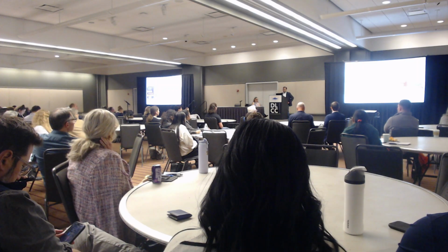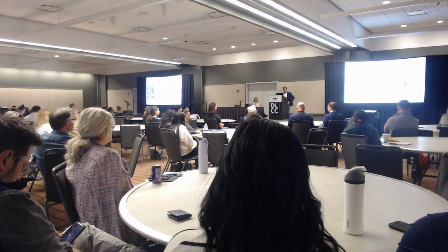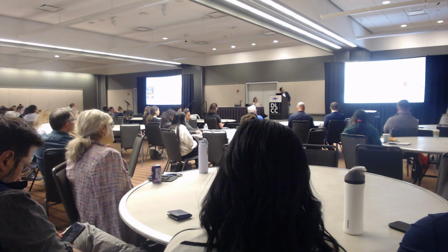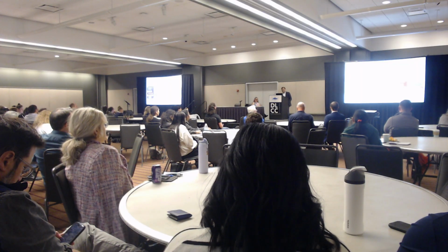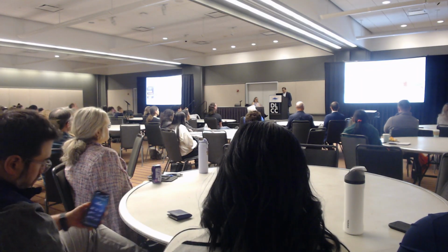So a lot of clinical colleagues can now follow their patients in a very non-invasive manner. And we are developing spatial ATAC-seq from the technology that Yanxiang just mentioned. We also recently launched Hi-C and HiChIP assays. That is what Claudia asked me to focus on: how did we optimize in a core setting? So I'm going to show that.